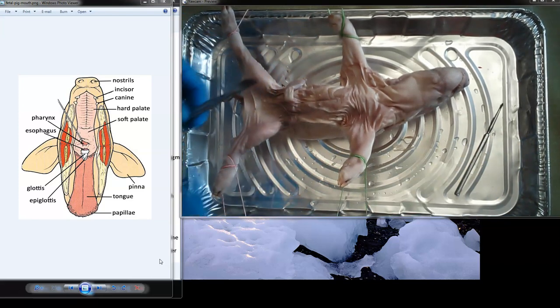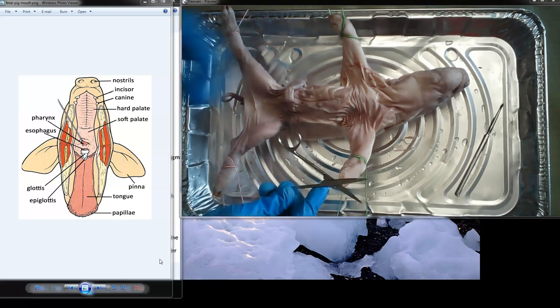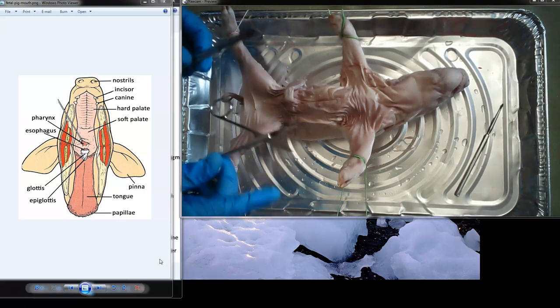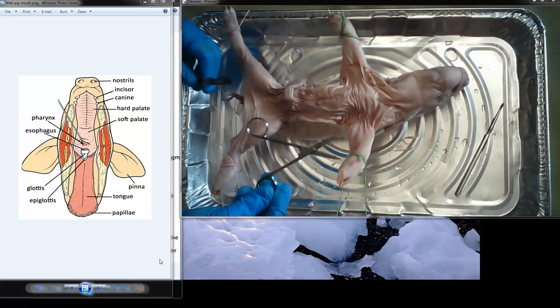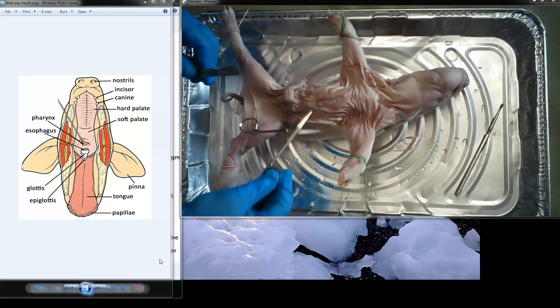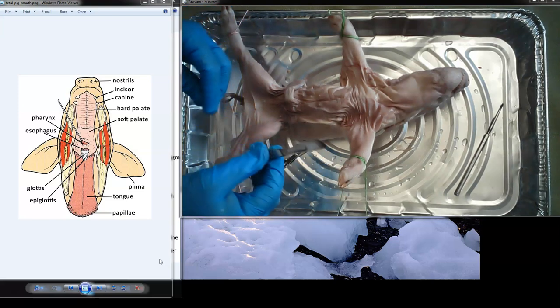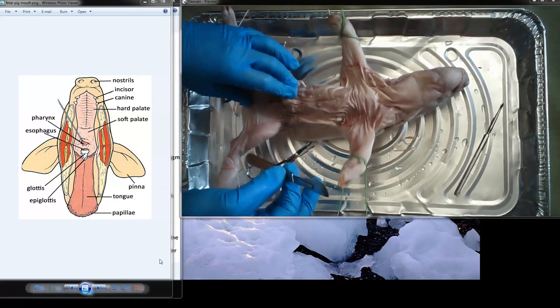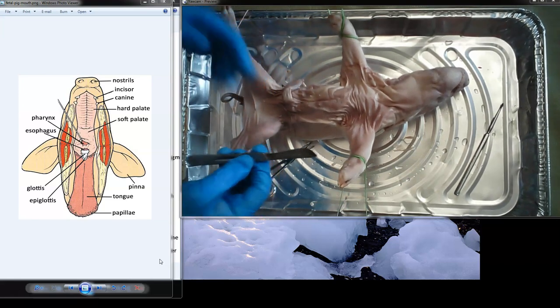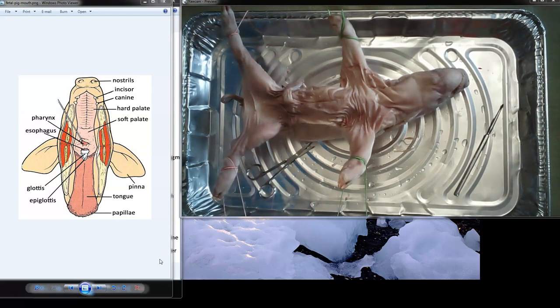The best tool for these jobs in almost every situation is this, a pair of scissors. These scissors are really, really good. They're very sharp. They're small. They can fit in small gaps and grooves. And what scissors allow you to do is get into the tissue and cut the tissue without going too deep. With a scalpel, if you know what you're doing, if you have a careful hand, then you can do the whole dissection with just the scalpel, but it's more likely that you're going to damage something.